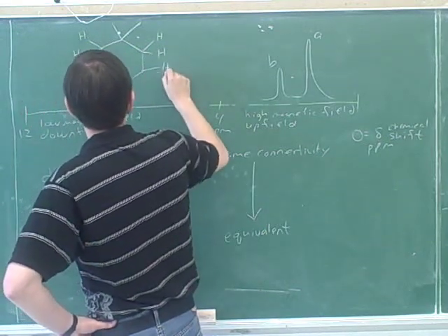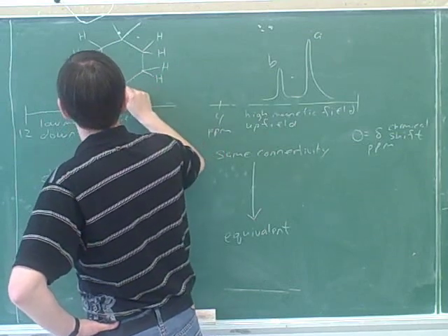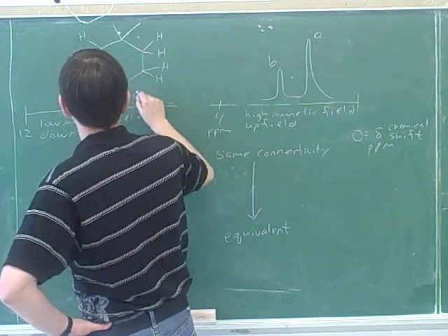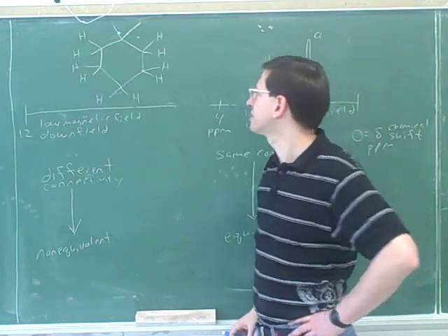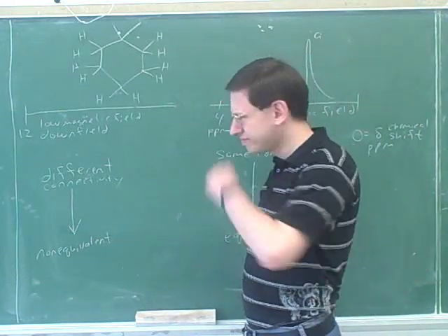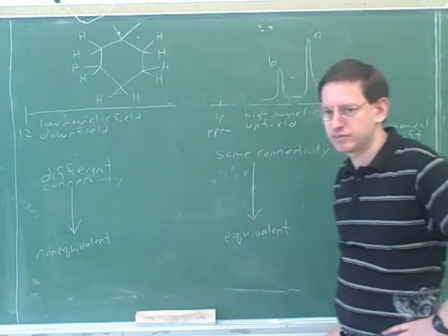Notice that even though usually in OChem we don't draw the hidden hydrogens, for obvious reasons when you're doing NMR, it's an excellent idea to draw in the hidden hydrogens because we're focusing on the hydrogens. How many peaks do you think we're going to get here?